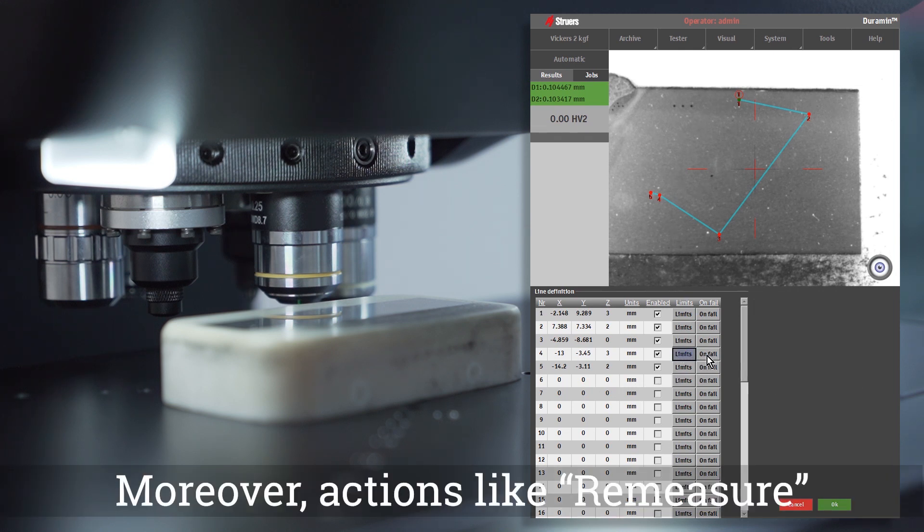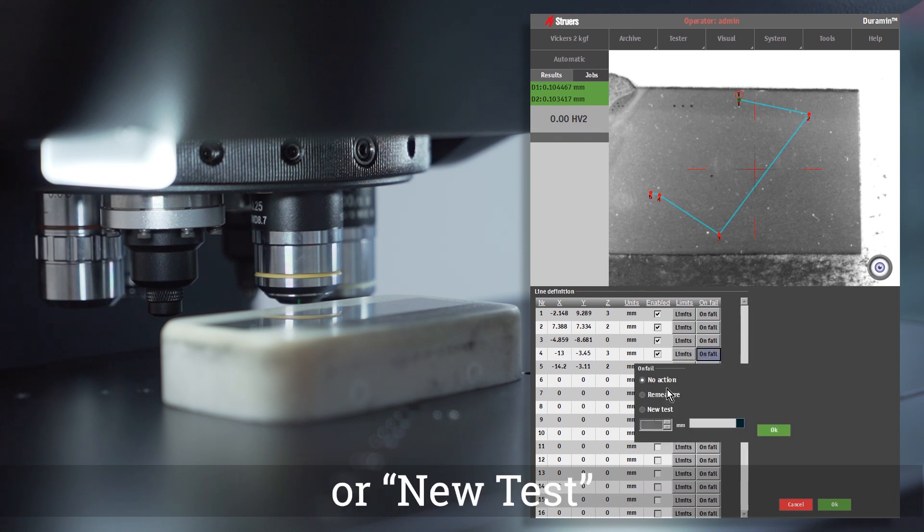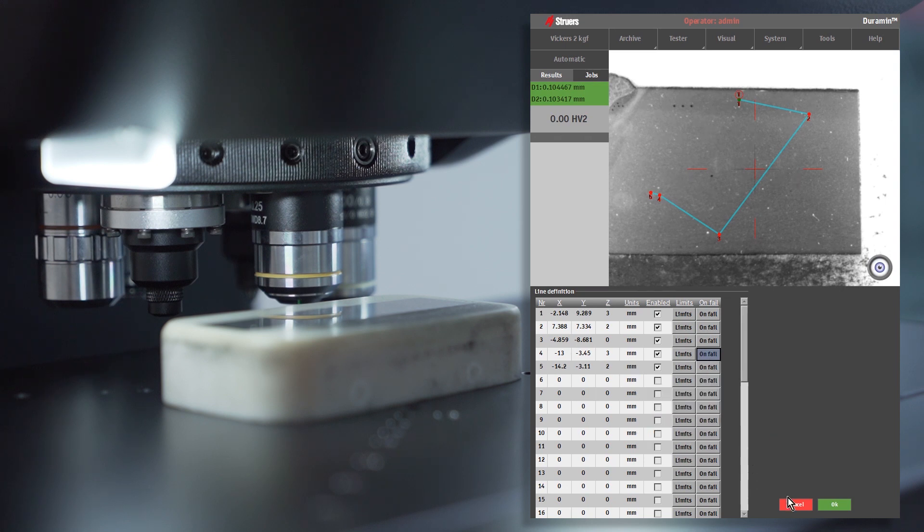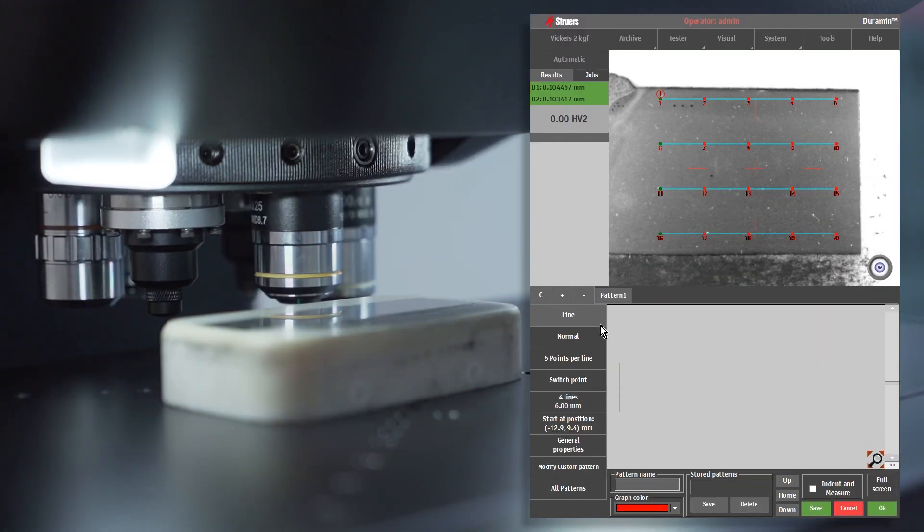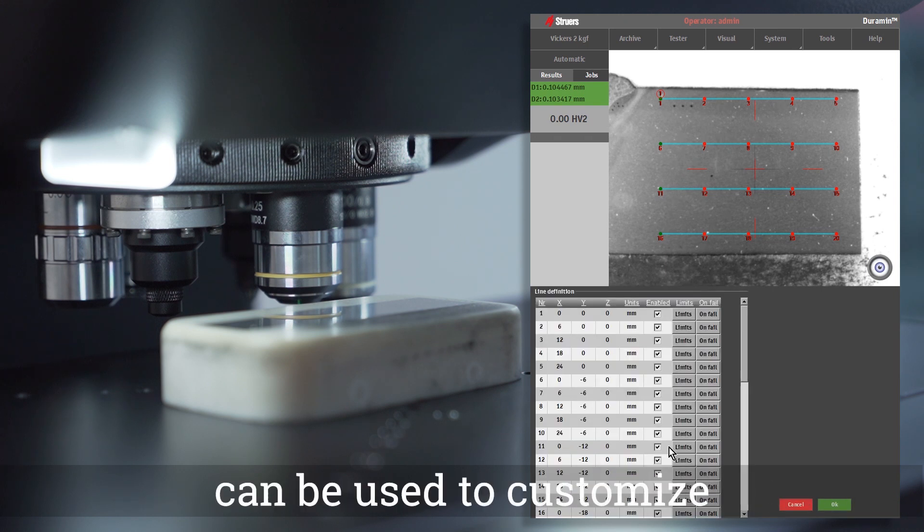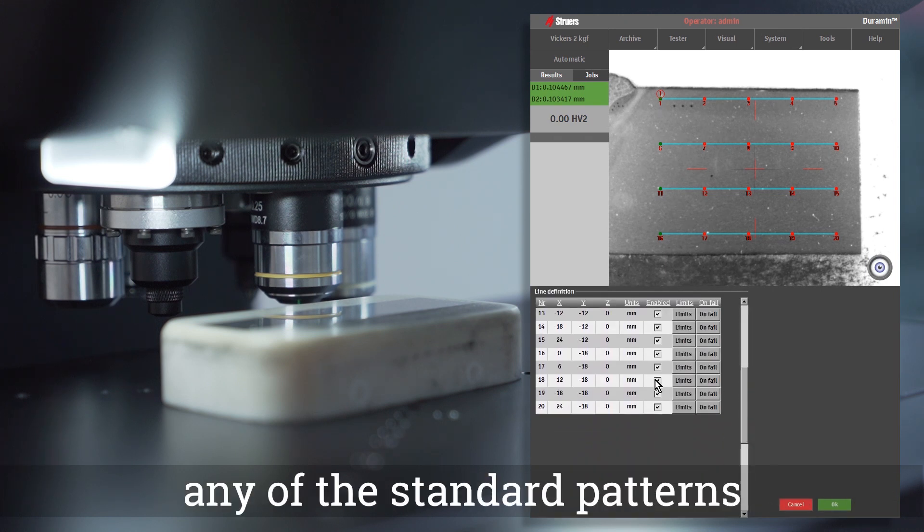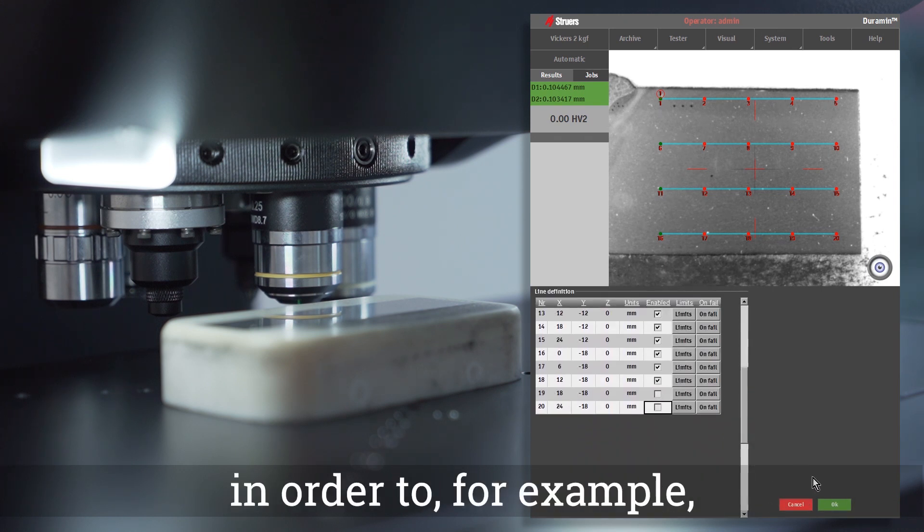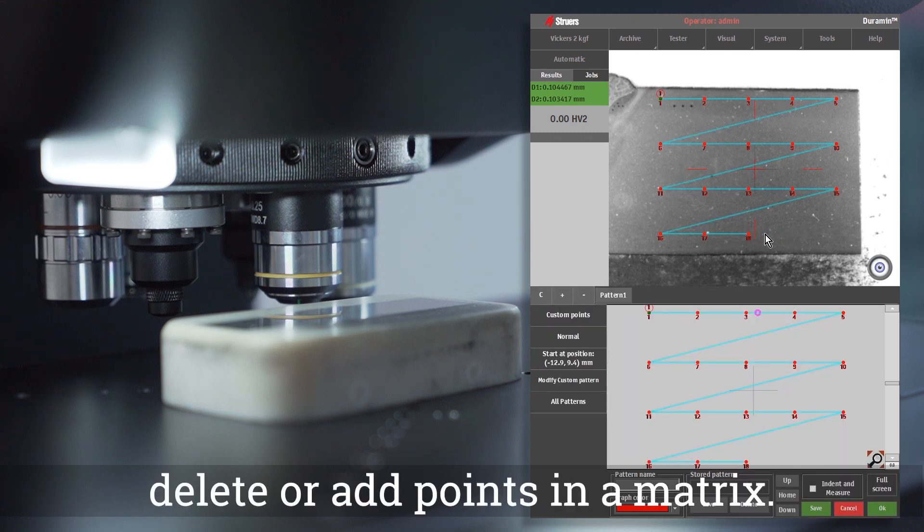Moreover, actions like Remeasure or New Test can be chosen for each indent. Also, the Custom Pattern Function can be used to customize any of the standard patterns in order to, for example, delete or add points in a matrix.